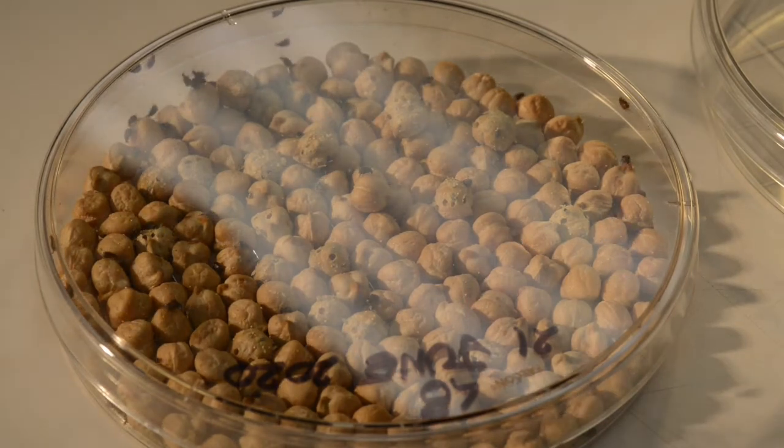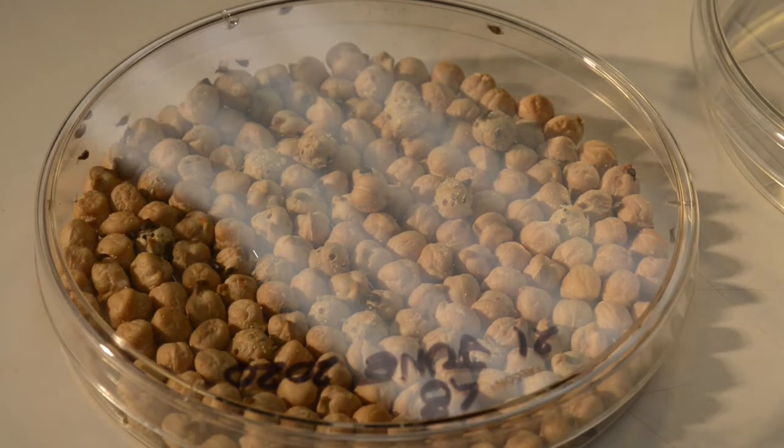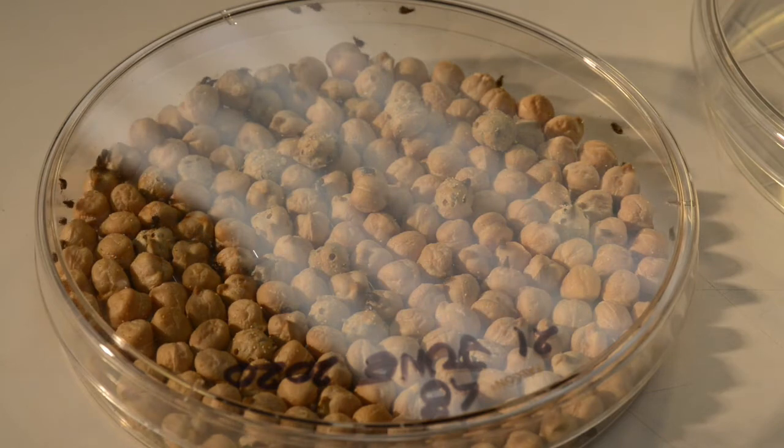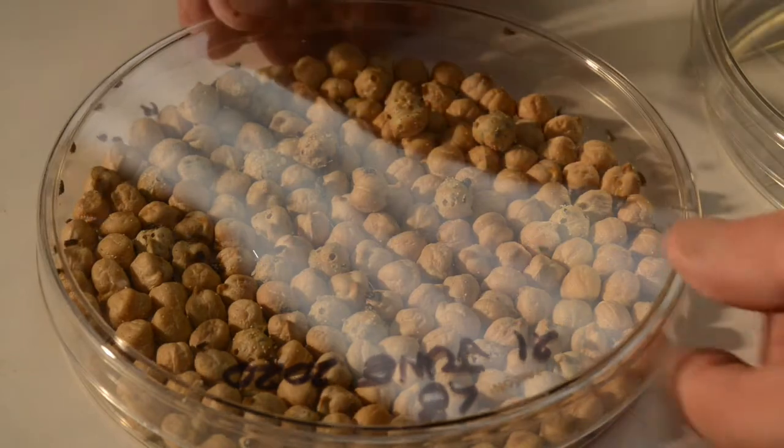In this video, I'll be showing you how to handle bean beetles, Callus abrucus maculatus, and how to tell the sexes apart.